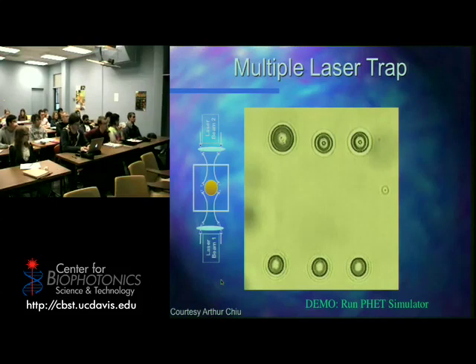The most common thing that we do at CBST is we do Raman spectroscopy. It's a type of spectroscopy that looks for vibrational modes within atoms, aggregate vibrational modes. Okay? I know that sounds strange, but if I have a lot more DNA, I will have a stronger signal that shows me the vibrations that are normal for DNA. If I have a lot more NADH, that signature will be enhanced compared to a healthy cell. So what I can do is I can trap the cell and do this type of investigation on it.